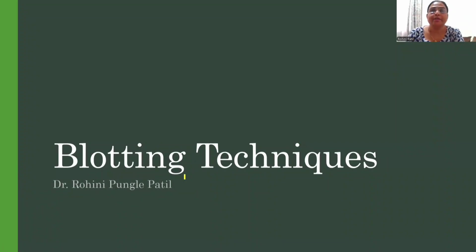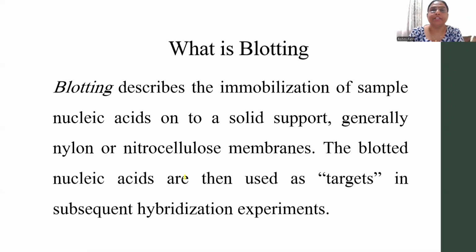Welcome. Today we are going to learn about the blotting techniques. What do you mean by the blot?